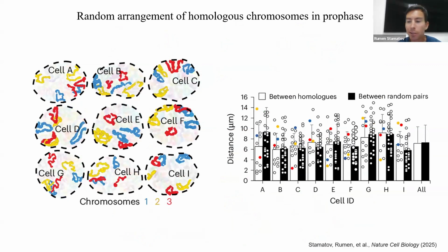One interesting question that we wanted to ask is whether each chromosome, where is it in space? Because there was this debate in literature before, what happens to the homologous chromosomes, right? Because in a diploid karyotype, we have 2 copies of each chromosome. Are they always next to each other, or are they on the opposite side of the cell? Because there were arguments for both theories.